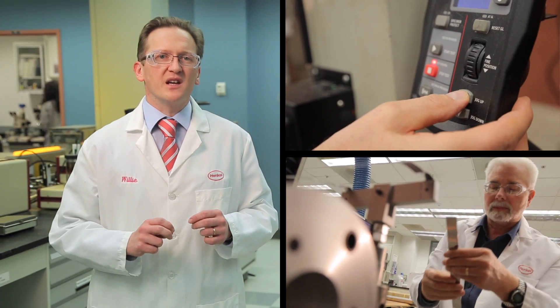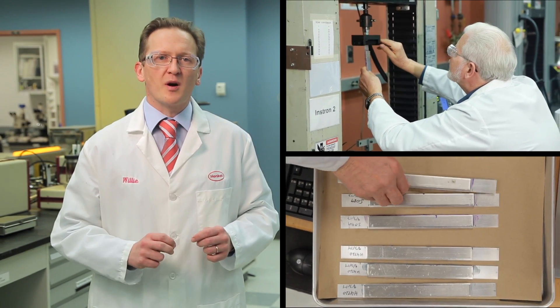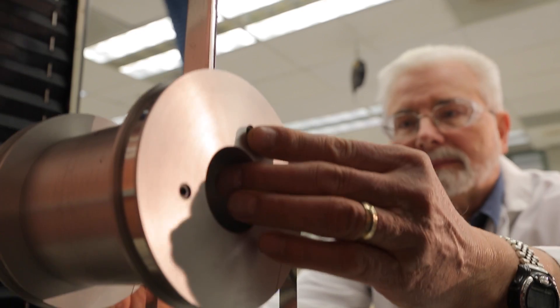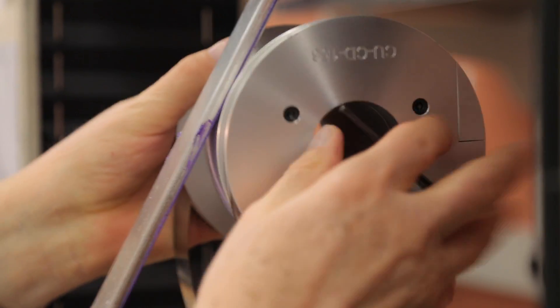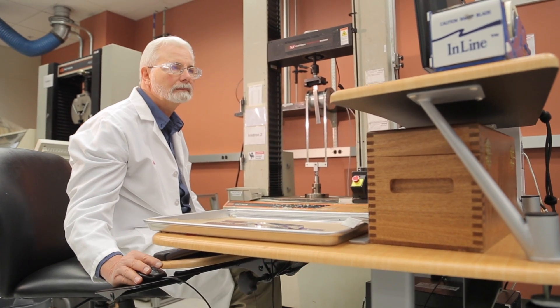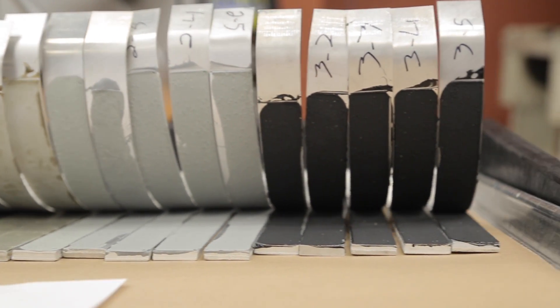A bonded assembly is secured in the climbing drum peel fixture in a mechanical properties tester. As the crosshead moves upward, the flexible substrate is wrapped around the drum fixture, peeling it away from its rigid mate. The test can be run using only the flexible substrate and this value is subtracted from the combined result to provide the peel strength of the adhesive alone.